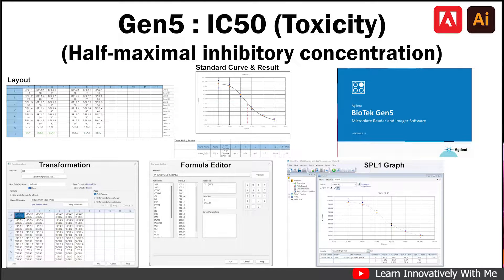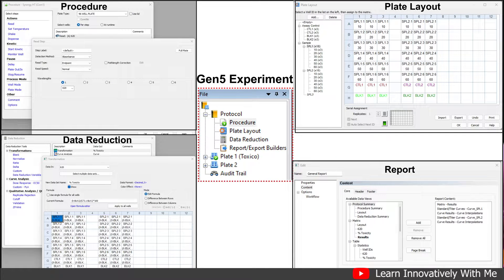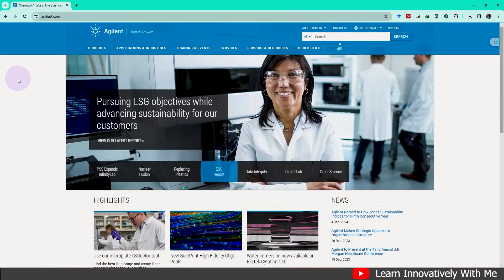Welcome everyone. Today we are exploring the widely used experiment IC50, or half maximal inhibitory concentration. This tutorial will guide you through analyzing IC50 in Gen5 software with ease. We will cover essential steps including protocol setup, procedure, plate layout, data reduction, and report generation or export builder.